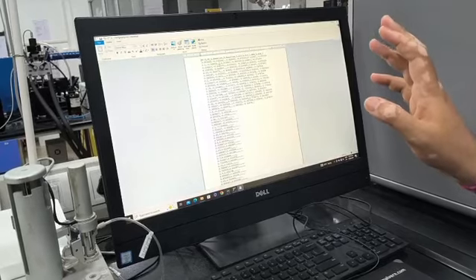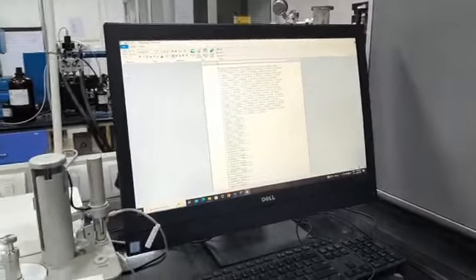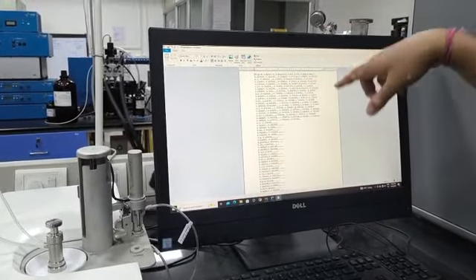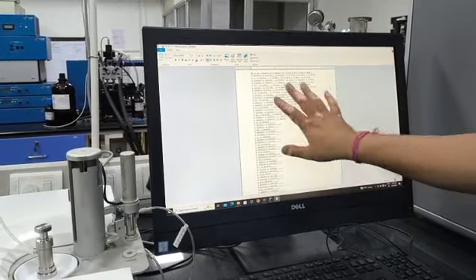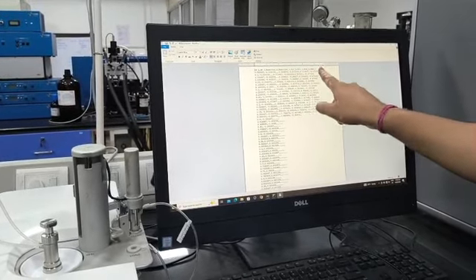Okay, but you will not get this in fitting, because this fitting is mathematically a formula that is incorporated in that software. So whenever you give this into Origin, it will be confused about which one is x and which one is y, so you have to remove this part.